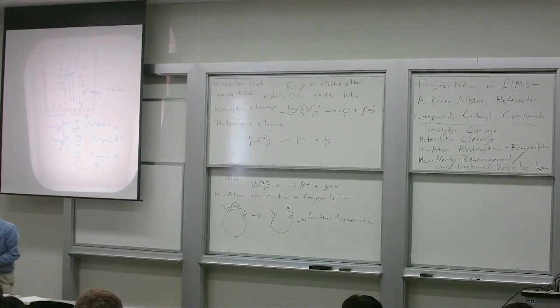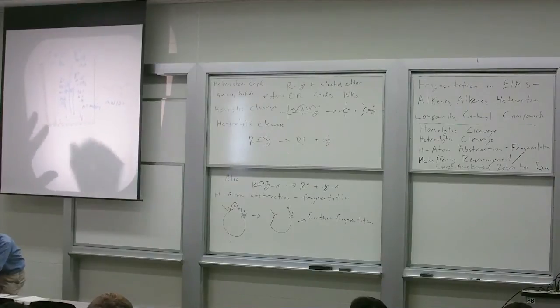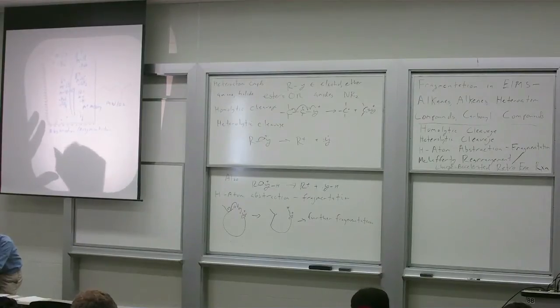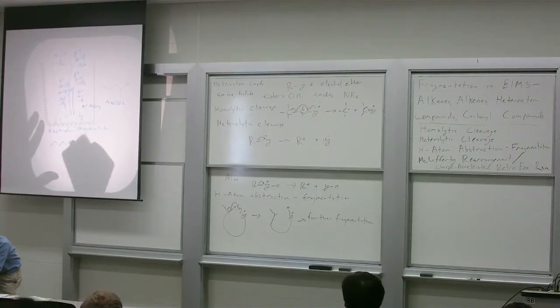Let's try the hydrogen atom abstraction fragmentation pathway and see where that gets us. If I try the hydrogen atom abstraction fragmentation pathway, and we'll just try one example of it. You can try more on your own and come up with a couple of other peaks if you like.